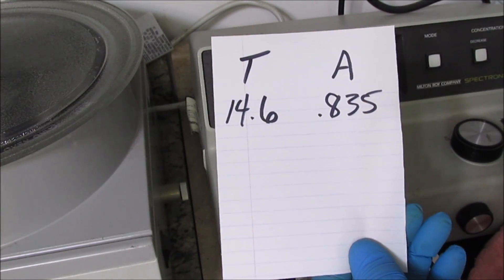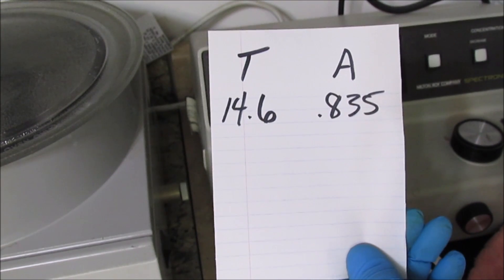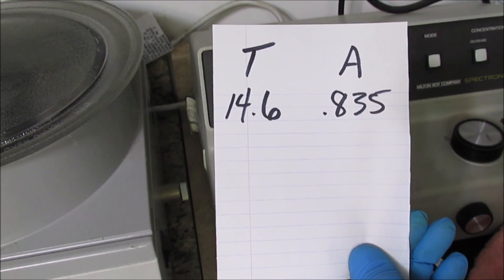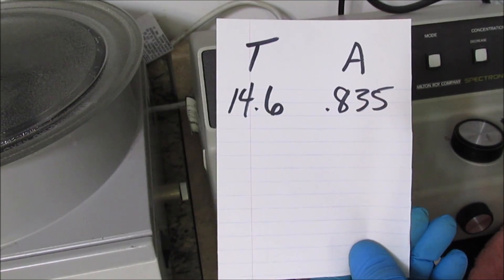I've recorded the readings on this little tag here, and now we're going to go look at the chart and see what our copper concentration is for this electrolyte sample.